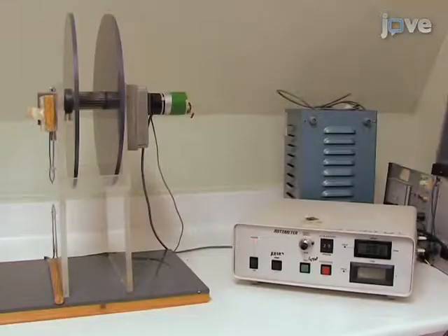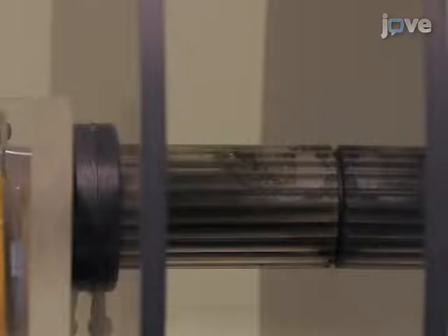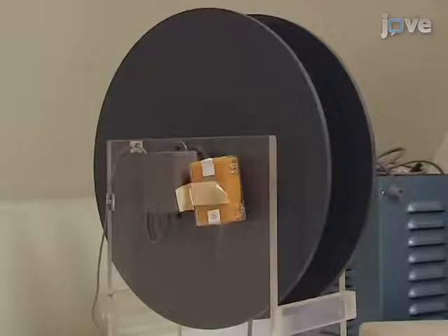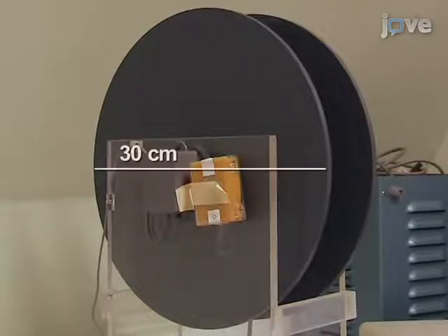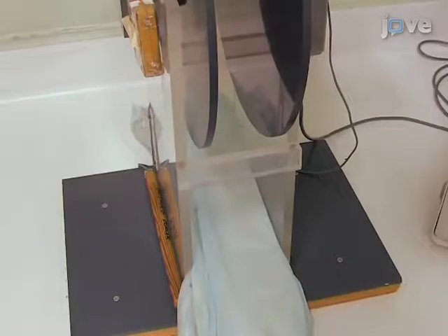The rotor rod seen here was built at the University of Oxford. The rod is 3 cm in diameter with a series of parallel ridges on its surface, which help the mice to grip it more effectively. A flange on each side prevents the mouse from leaving the rod; they are 30 cm in diameter and 6 cm apart. The rod is secured 30 cm from the base of the apparatus. A soft padded surface is placed at the base to cushion any falls.